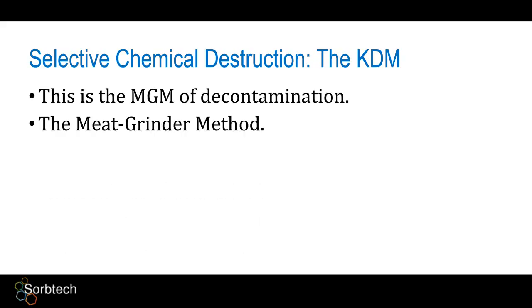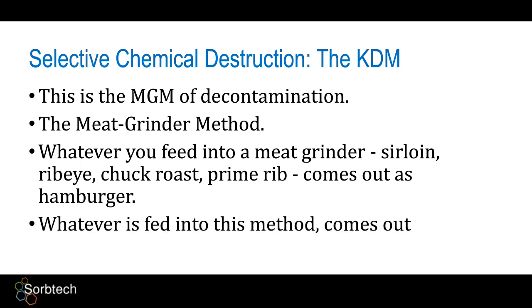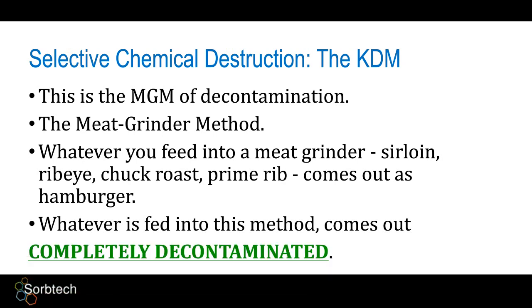This reaction is the MGM of decontamination, the meat grinder method. Whatever you feed into a meat grinder, be it sirloin steak, ribeye, chuck roast, prime rib, doesn't matter, it comes out as hamburger. And whatever is fed into this method comes out completely decontaminated.